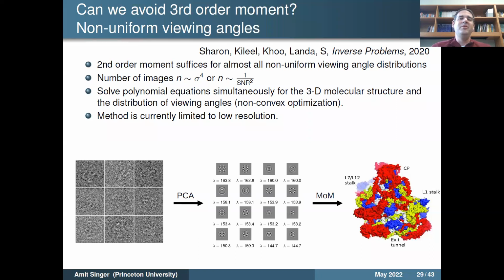Well, at least for those who are not too familiar with multi-reference alignment, it seems like the cryo-EM problem should be more difficult when the distribution of rotations is not uniform, because the coverage in the 3D Fourier space is now less optimal. But it turns out that from the point of view of not knowing the rotations, this is actually a better situation. And somehow it breaks the symmetry that we have when we do, say, Kam's method with the uniform distribution of viewing directions.